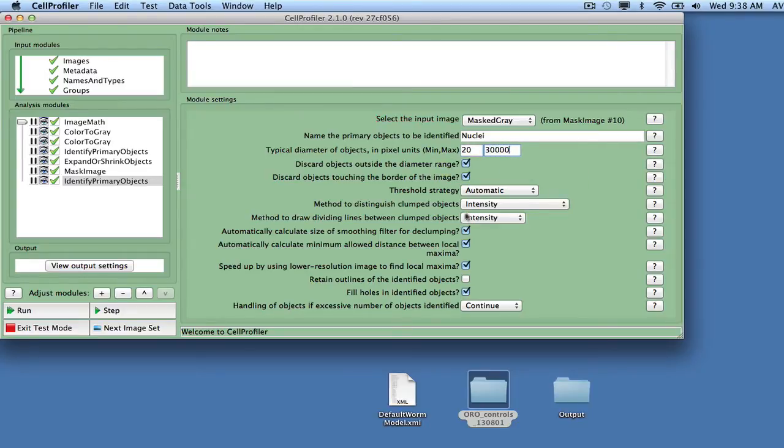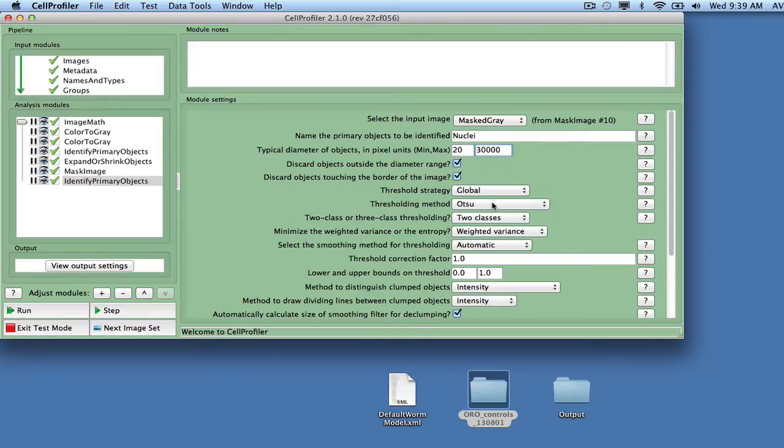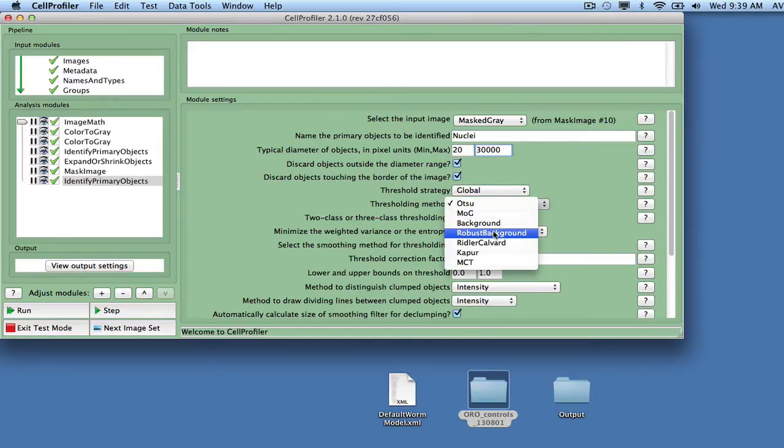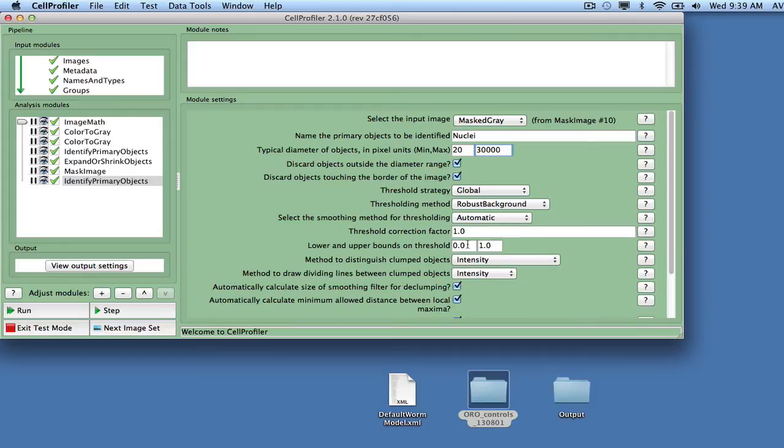We use Automated Thresholding with Global, Robust Background as the method. Since there is a risk for empty wells, we also set a minimum threshold level at 0.09.